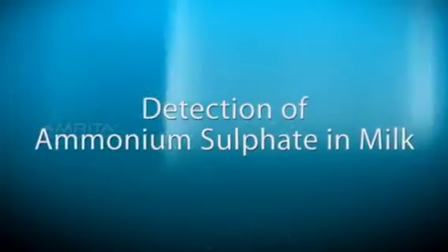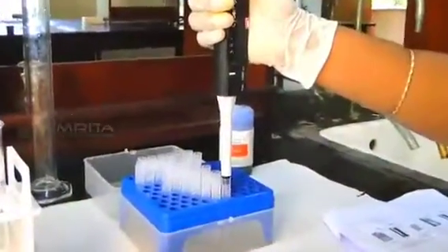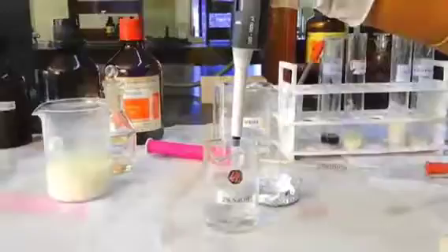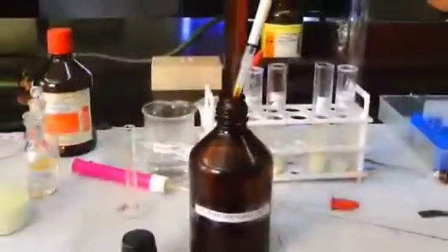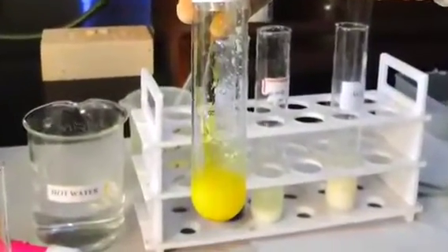Detection of ammonium sulfate in milk. Pour 1 ml milk into a test tube labeled ammonium sulfate. Pipette out 500 microliter of 2% NaOH solution and add this to the test tube. Discard the used tip and insert a new tip. Pipette out 500 microliter of 2% sodium hypochlorite and add this to the milk solution. You will notice that the color has turned light yellow.